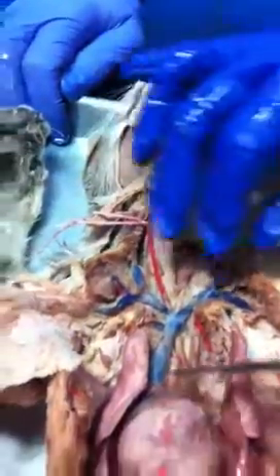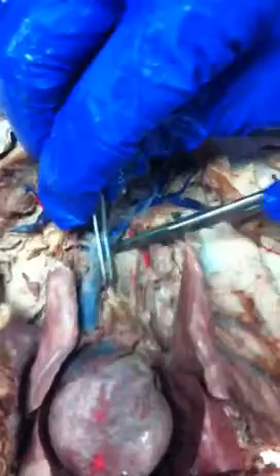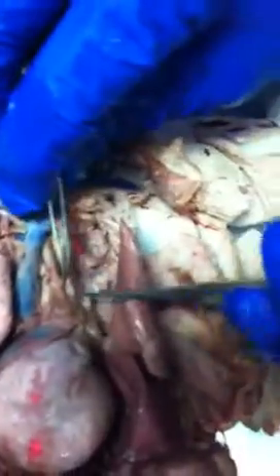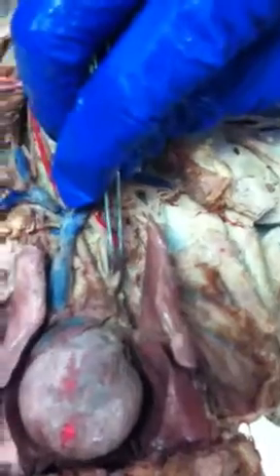Okay? Branches off your dorsal aortic arch are two. This is branch number 1, which is brachiocephalic artery. This is branch number 2, which is left subclavian artery.